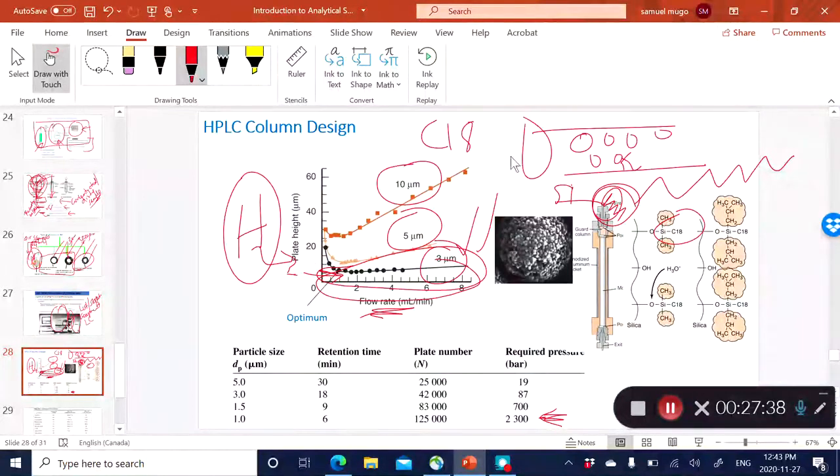So essentially, in this slide, I'd like you guys to remember the importance of using very, very small beads because they improve your separation efficiency, since the equilibration event, measured as height equivalent to a theoretical plate, is fairly low. But the disadvantage is they result in very high back pressures, meaning that you need very good pumps and very good seals so that you do not get leakages inside the column.